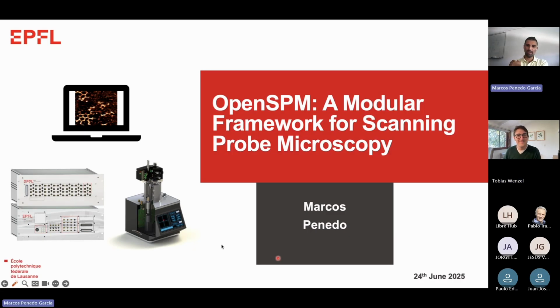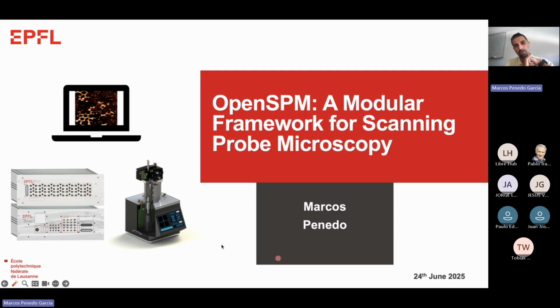Thanks, Tobias, for the kind invitation and introduction. So, as you said, I'm based in Lausanne at the EPFL, at the university, and our group mostly works on developing new instruments that you normally cannot find on the market, so you cannot buy them, or on combining different instruments, mostly with scanning probe microscopes.